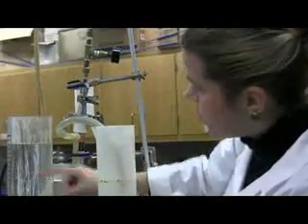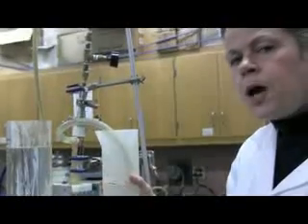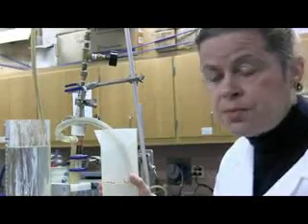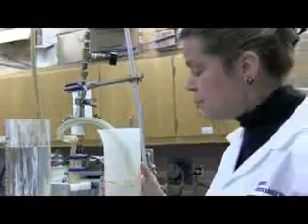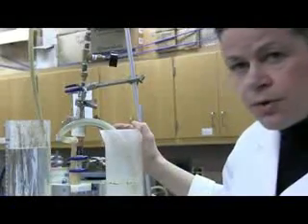Part of your experiment is going to be to measure the rejection coefficient of the membrane for milk protein. That's the experiment that you're going to do. So you're going to need to measure concentrations of protein in the milk. The concentration of protein is read off the label from the bottle of milk.